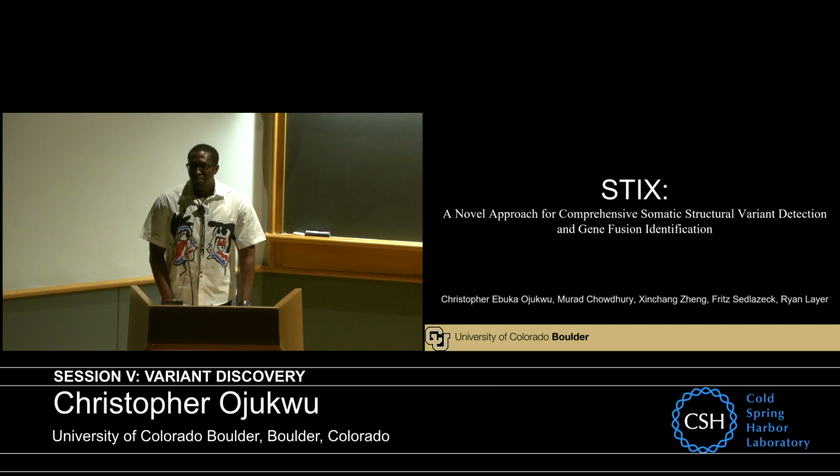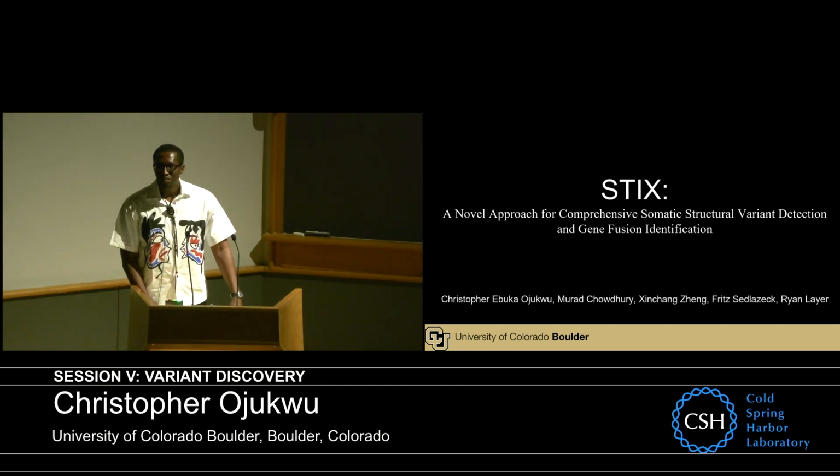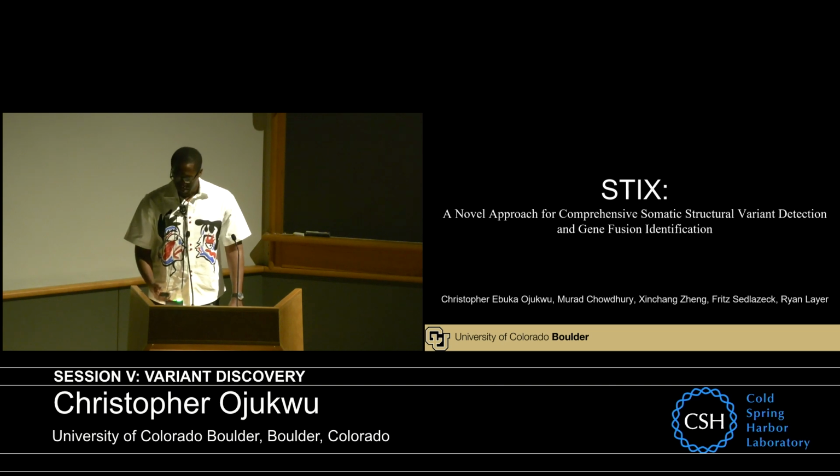Hello, everyone. My name is Christopher. I'm a PhD student at the University of Colorado, Boulder. And today I'll be talking to you about STIX, a method for detecting somatic structural variation and identifying novel fusions.